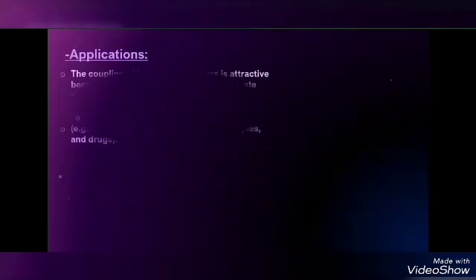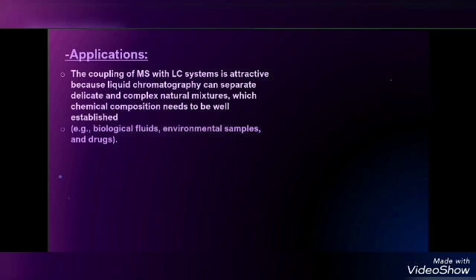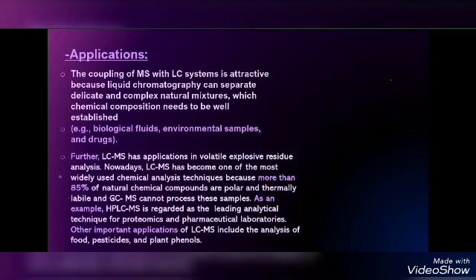Applications. The coupling of MS with LC systems is attractive because liquid chromatography can separate delicate and complex natural mixtures whose chemical composition needs to be well established, such as biological fluids, environmental samples, and drugs. Further, LCMS has applications in volatile explosive residue analysis.